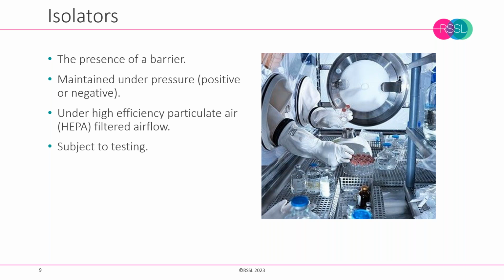So that risk is obviously lessened if there's no holes, but it's also less if there's unidirectional airflow as well.